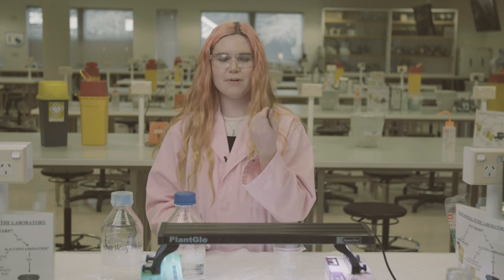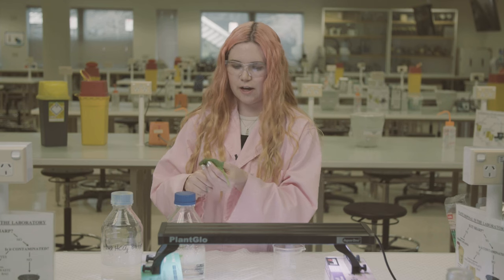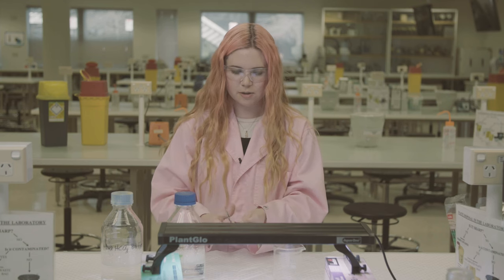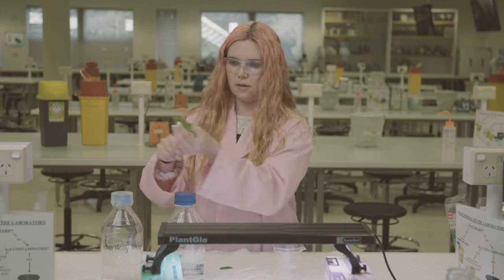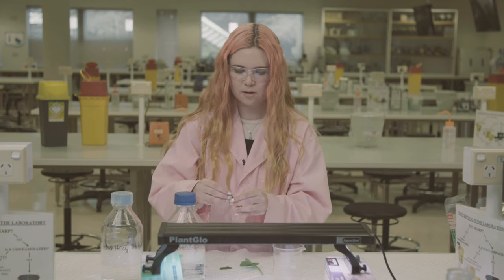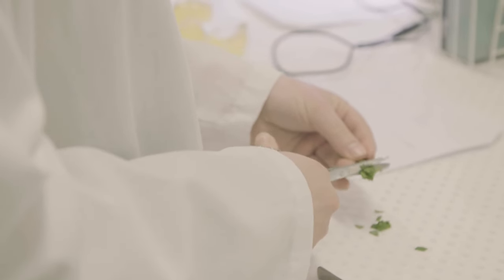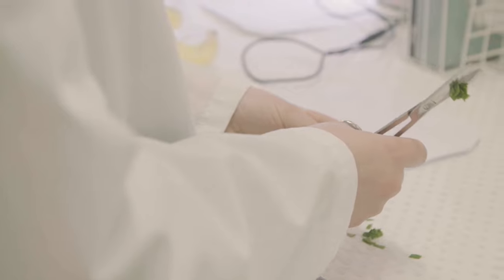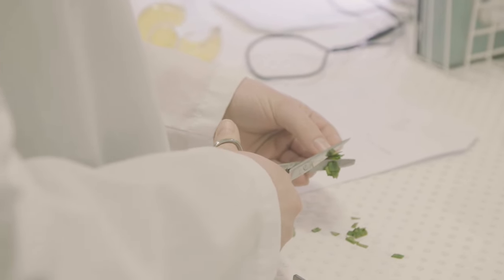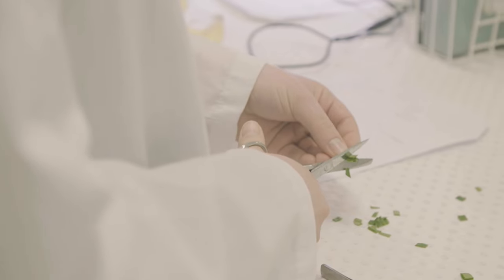I'm doing it today with spinach leaves, which work really well. So you take your leaf and usually I cut it into some thin strips like so. Then it's most efficient if you just stack them on top of each other and cut them into smaller pieces — just small squares.